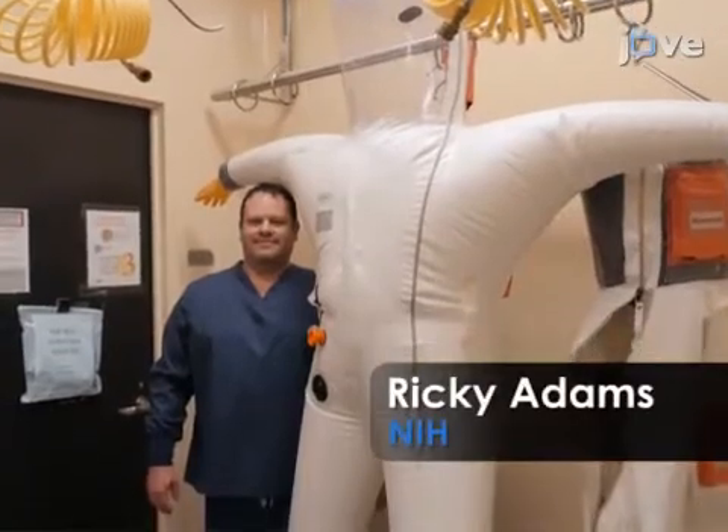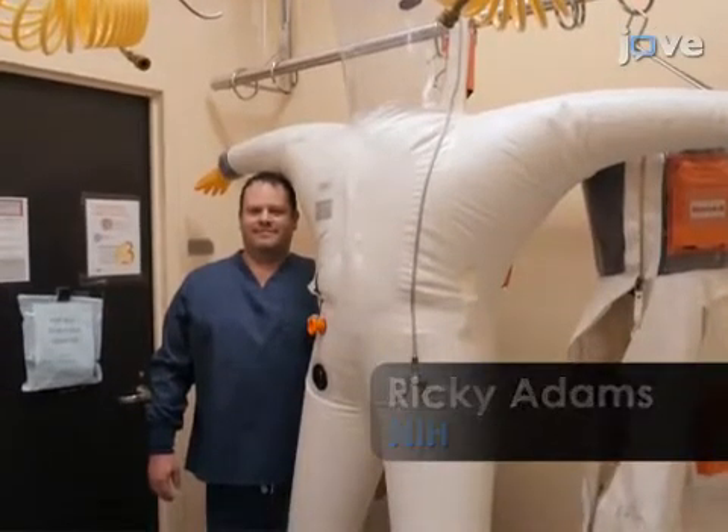Demonstrating the procedure will be Ricky Adams, a technician from the NIH Integrated Research Facility at Fort Detrick.